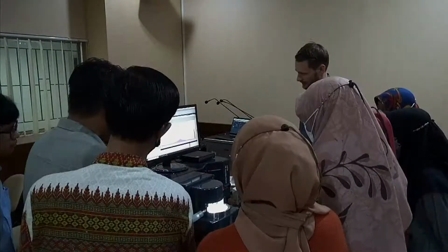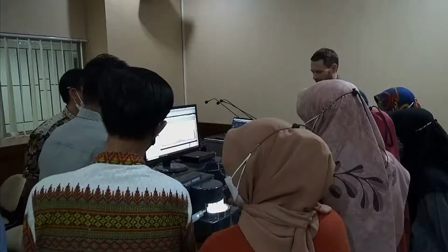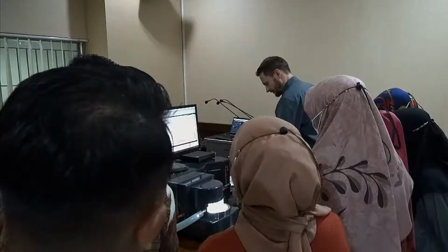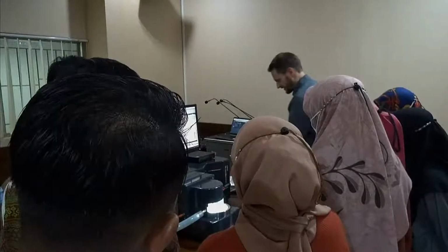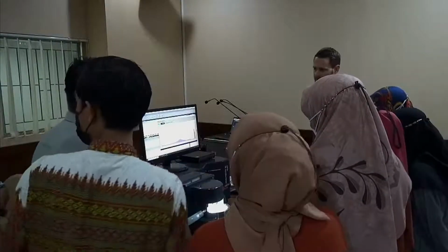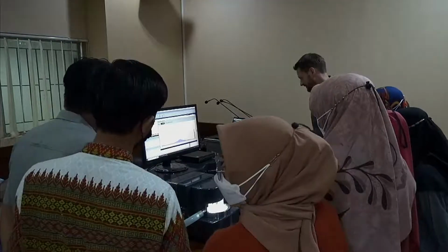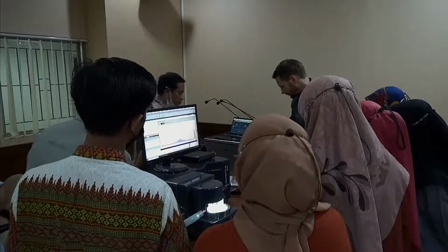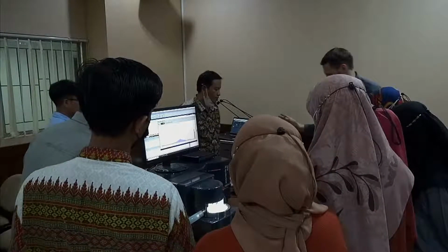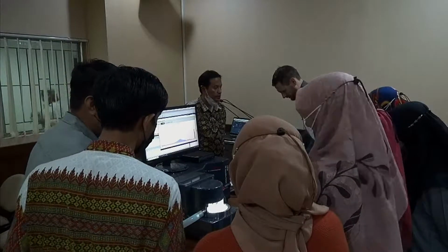And now let's have a look at the result for this coconut milk. If we had more time, of course, what we could do is check some sampling issues. Take it from the bottom, take it from the top, compare the results without shaking, of course. Pretty sure you'll see a different curve for the two. The next thing that we're going to do, because I think we can do the rest in the end if we have time, I want to do now something which will be very interesting.